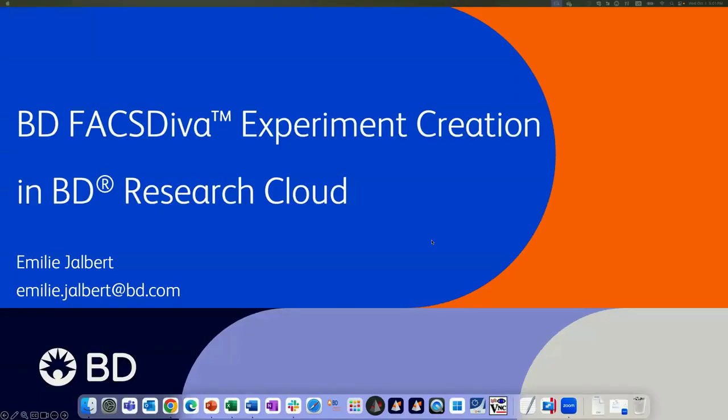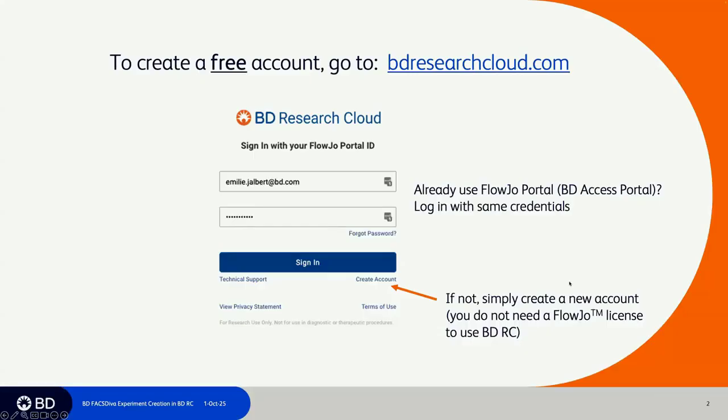Thank you for joining today's webinar, BD FACSDiva Experiment Creation in BD Research Cloud. To create a free account for BD Research Cloud, just go to bdresearchcloud.com. If you already use the FlowJo portal, BD Access portal, then log in using those same credentials.